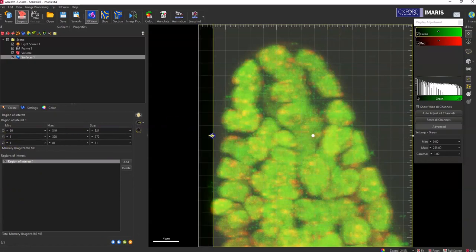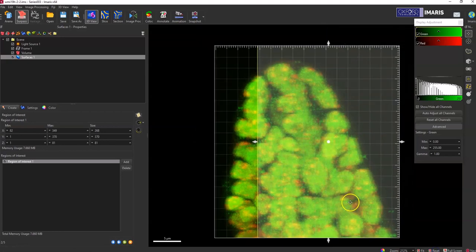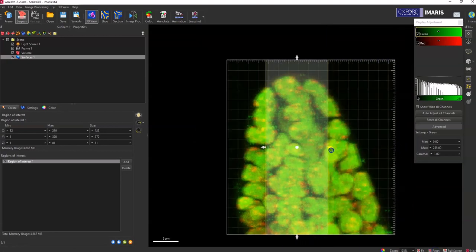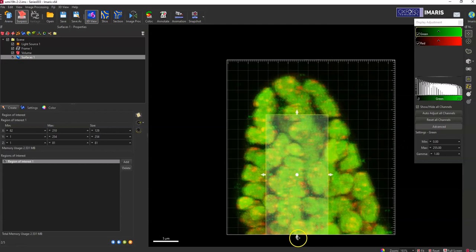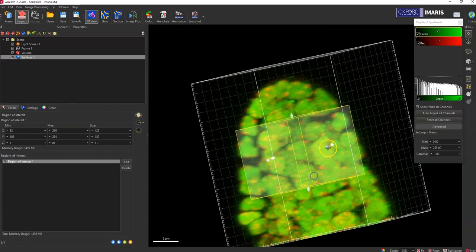So here you're going to select what you want your region to be. And I'm just going to randomly select a shape that we'll be able to see in the end.